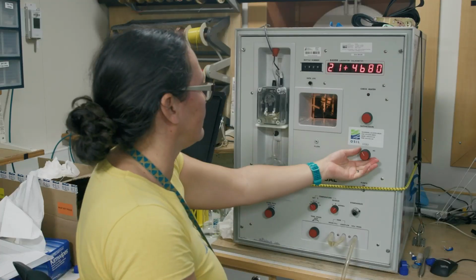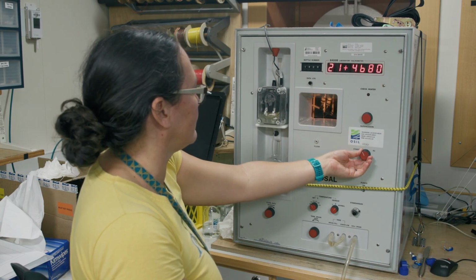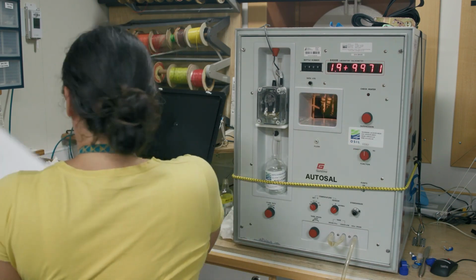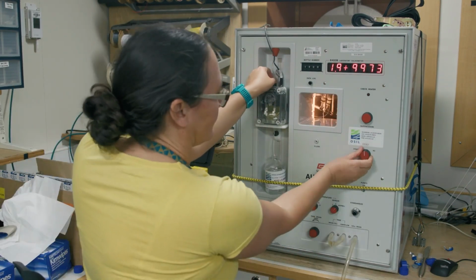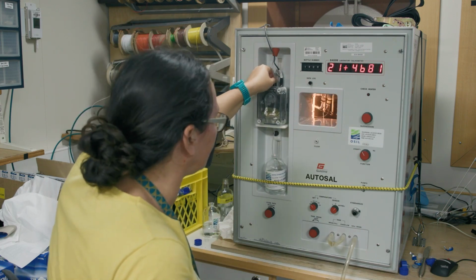After 3 flushes and fills as before, we let the temperature stabilize, switch to read, and check that the value displayed is still nominal. Record the value, then we draw another sample from this bottle by switching to standby, flushing and filling once, switching back to read.